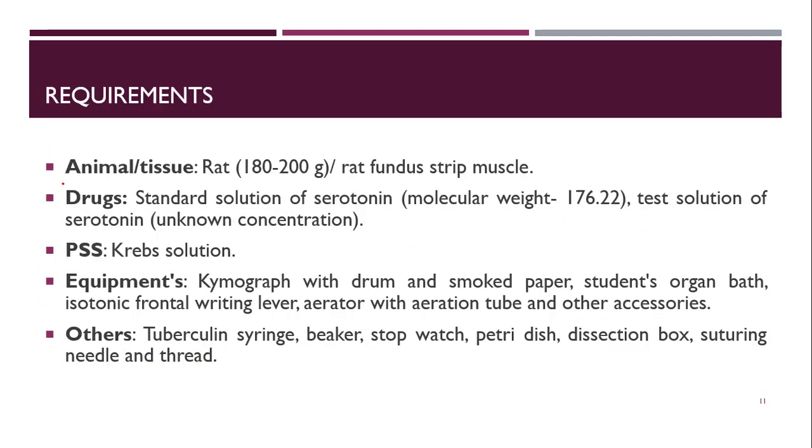So the requirements are: the animal, we have to take a rat, with weight 180 to 200 grams, and the tissue that we have to take is rat fundus strip muscle.